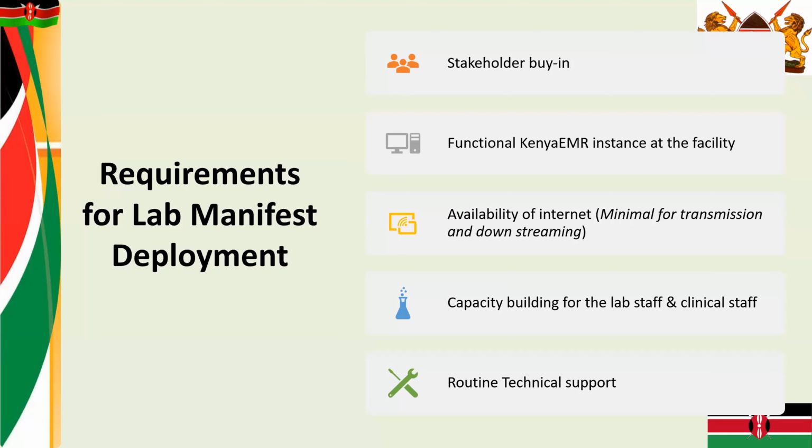The other requirement, which is key, is knowledge in terms of training. The lab staff needs to be trained on how to use this module and how it affects their workflow. That also goes for the clinical staff, so that they can create their test orders through the system, through the EMR, so that the workflow can be harmonized.